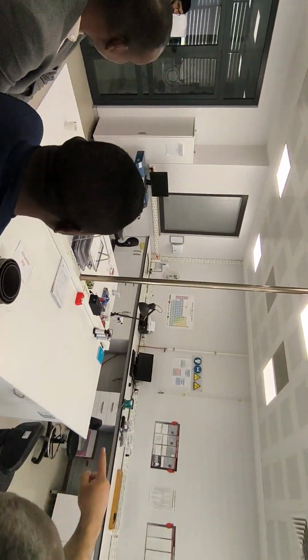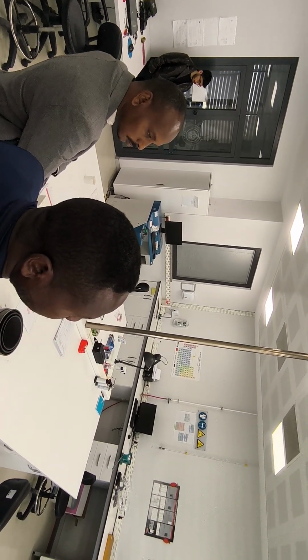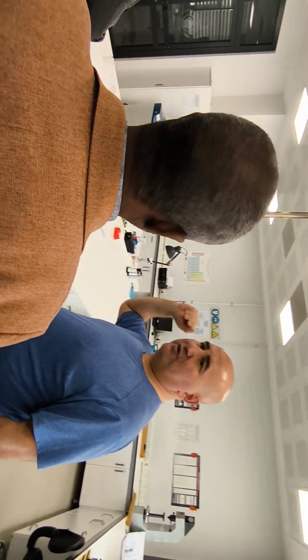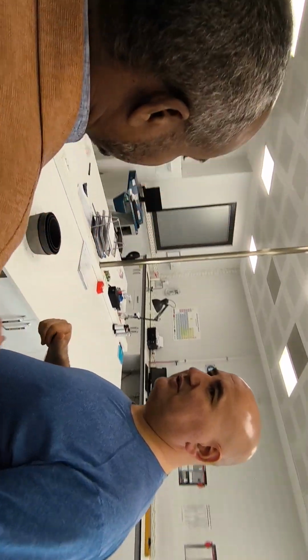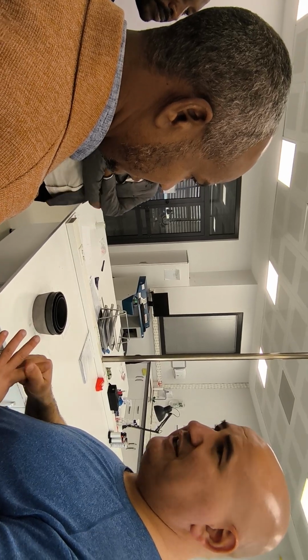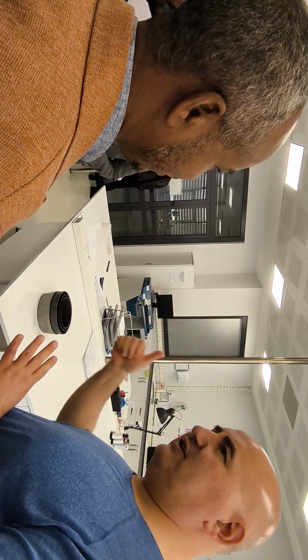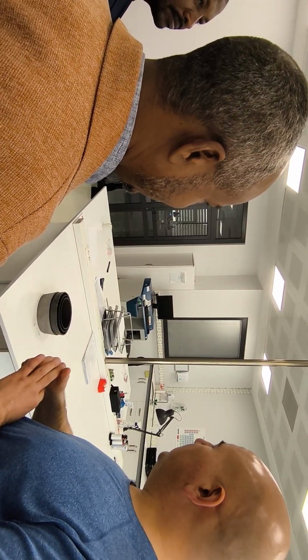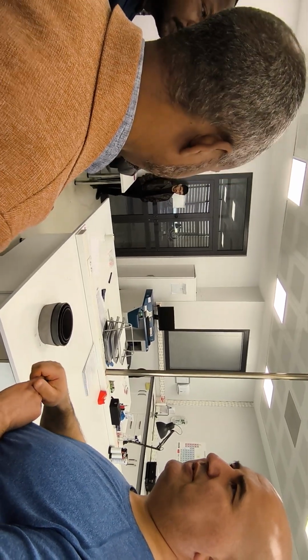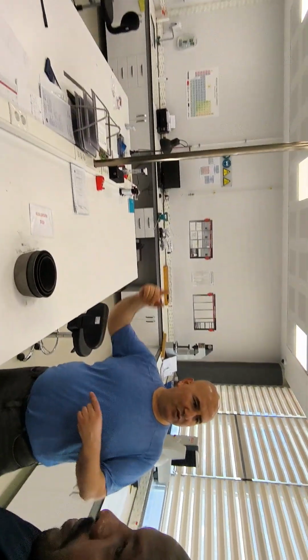And this one is optic emission spectroscopy. It's for metallic parts. If you want to see the chemical composition of metals, steel, copper, tin. How many items? We have six items: iron, copper, zinc, carbon. With iron, we can see the carbon inside the iron. We have cobalt, nickel, aluminium, magnesium. So for all this kind of alloys, we can see the chemical composition inside.